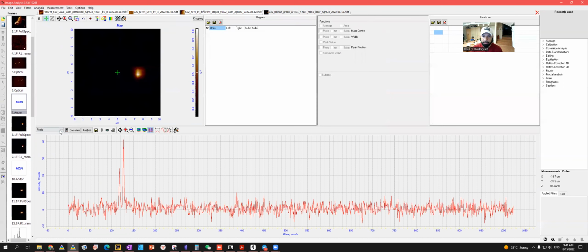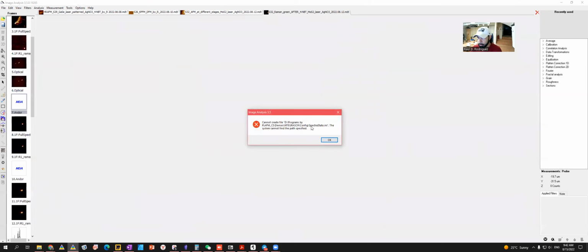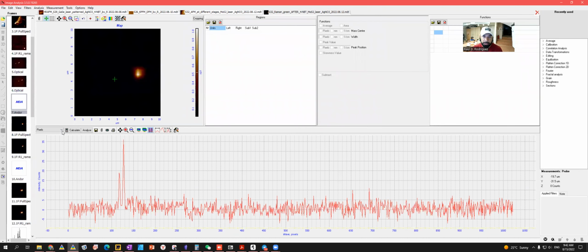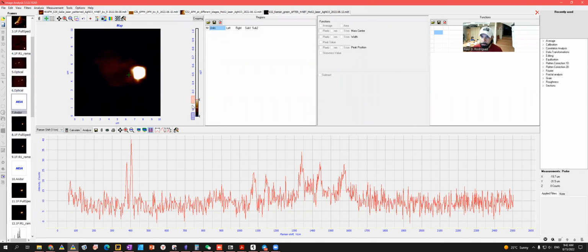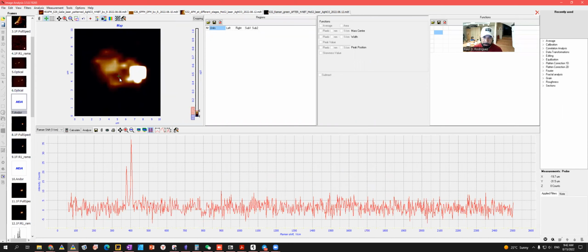And once you come back here, for some reason, these guys decided that every time you need to change to Raman shift. It's a Raman microscope with a Raman spectrometer. By default, if I change from one side to the other, besides the annoying errors it gives, you have this. You cannot set by default, or I don't know how to set by default, the Raman shift. Hopefully those guys will be useful enough to correct those mistakes.